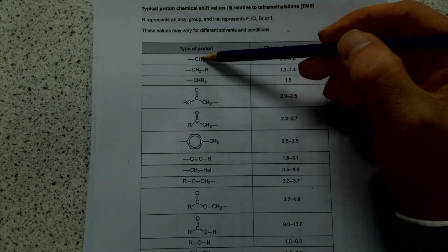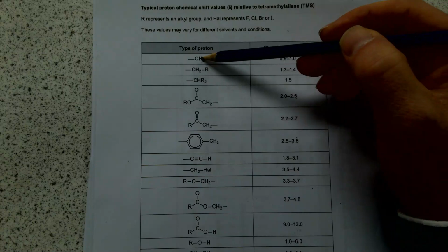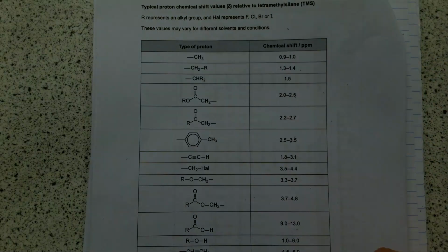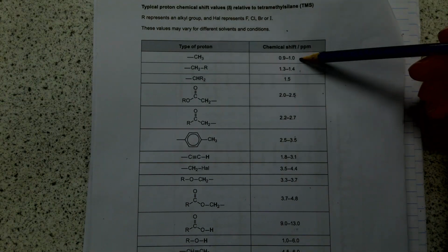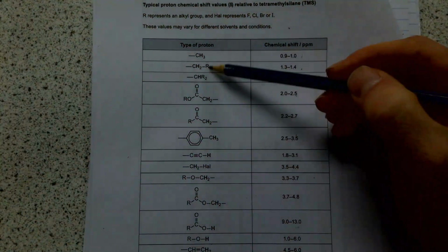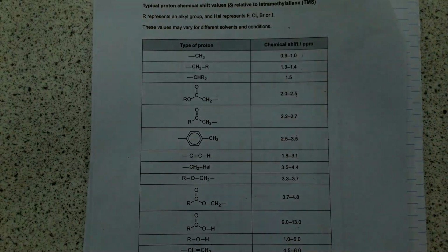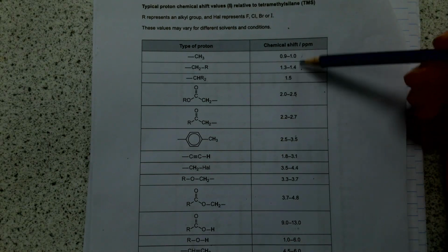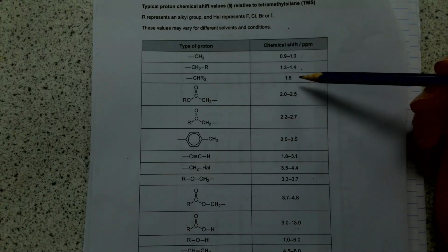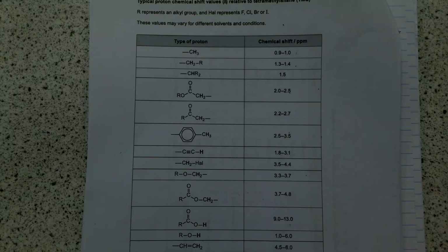So the CH3's there. Any CH3 that's in an alkyl chain, in other words, not next to something interesting, is going to have a chemical shift at 0.9, meaning it's going to come around about here on the spectrum. A CH2 or a CH that are not interesting, the alkyl ones, are going to have ever so slightly different chemical shifts in the same region of the spectrum, but slightly different places. All of the other ones you're going to have to get familiar with by doing practice examples.